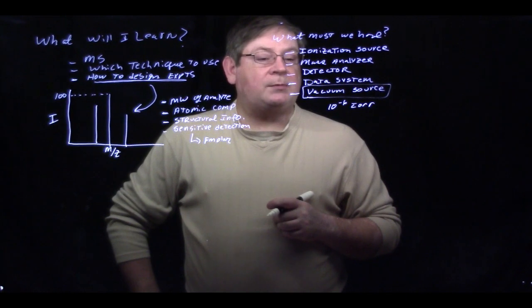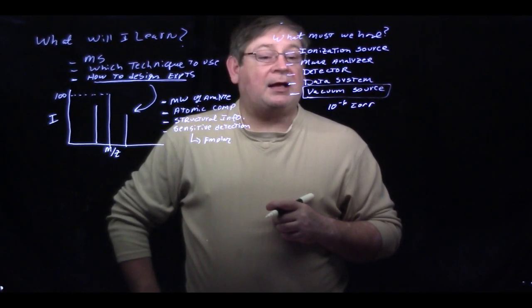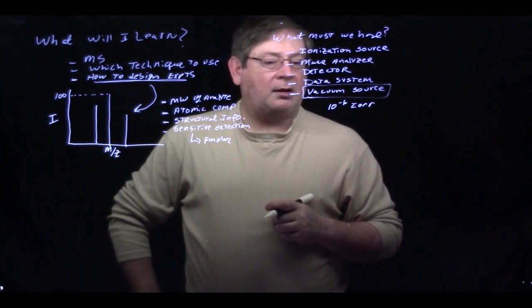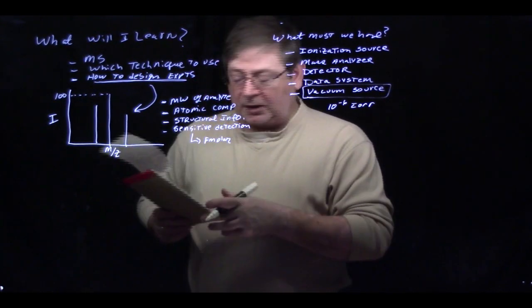And the reason you need that is because you don't want your ions running into any air molecules or anything else really, because they can tend to react with those types of things. So you have to have a very high level of vacuum in your system.